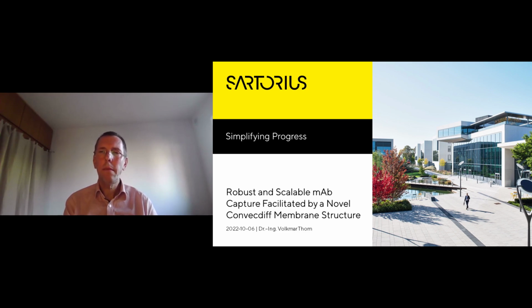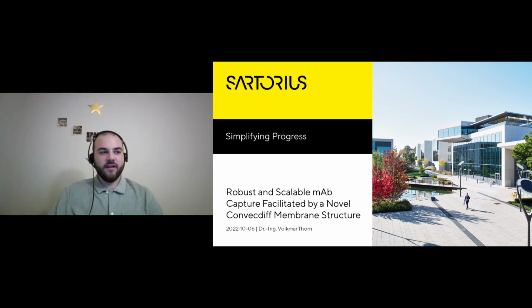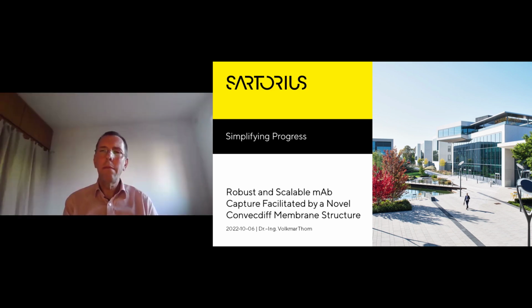And are there any studies done on input feed concentrations, impact of higher titers on DBC? Yes, so we typically don't see more or less impact than you see on a chromatographic resin that's in the market. There might sometimes be impact. If there is, it's in a similar range.